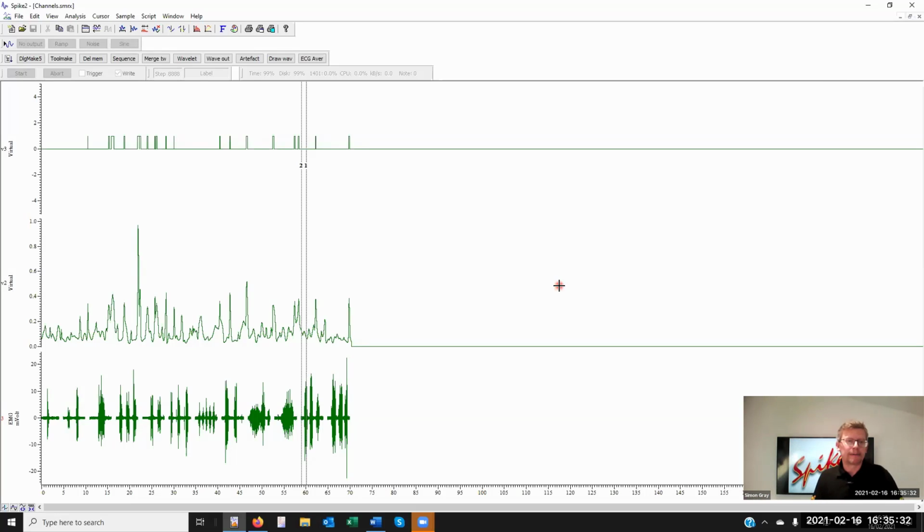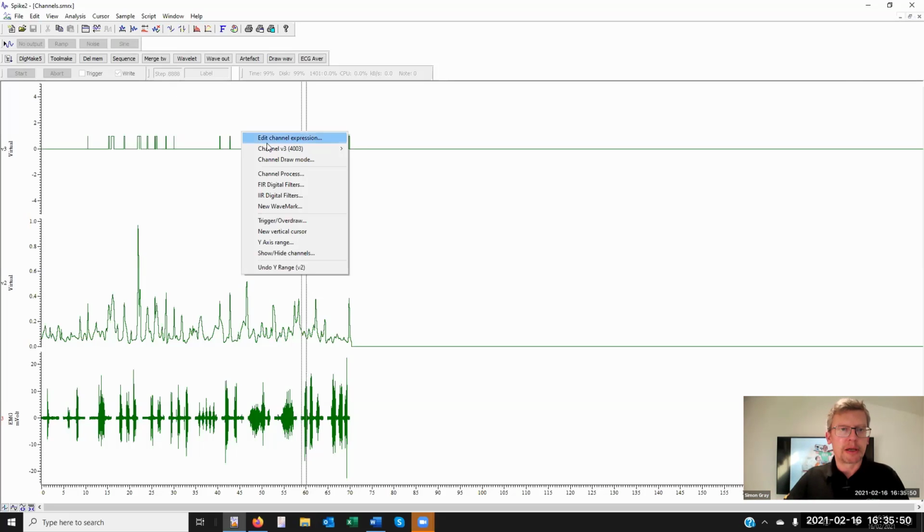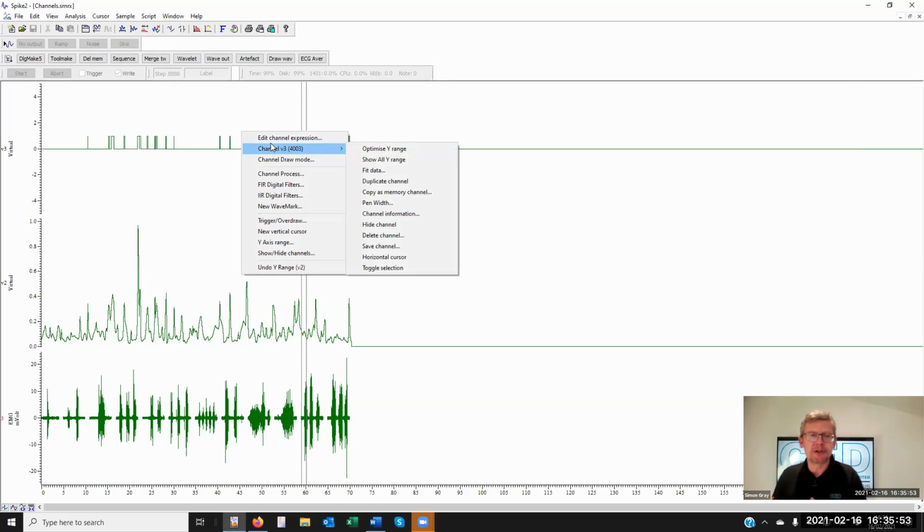Right. We've been talking about virtual channels so far, and I'm being pushed a little to go on to the active cursors. So I guess we need really just to finish off the other functions before we do that, and then we can continue with the idea of reacting to an incoming waveform online, and at least placing a mark in the data file to say we found an event, and that could then be used to trigger a sequencer via a script.